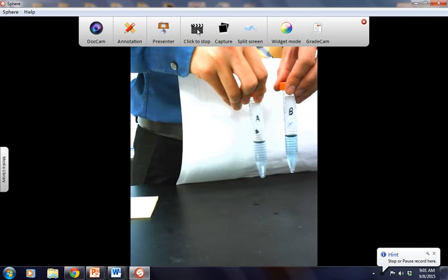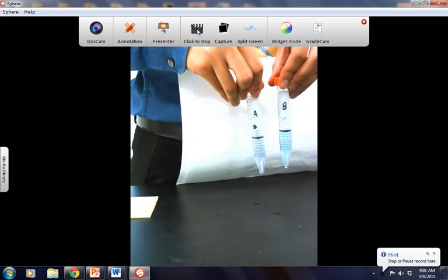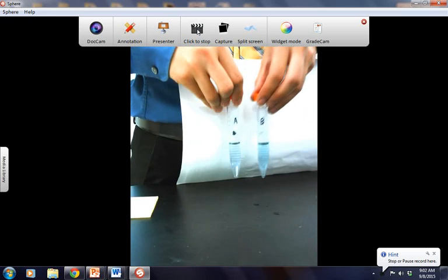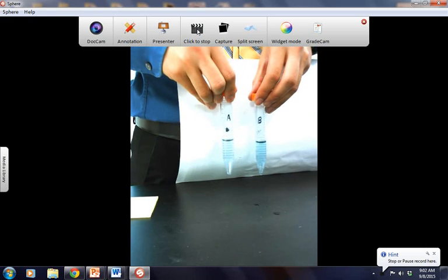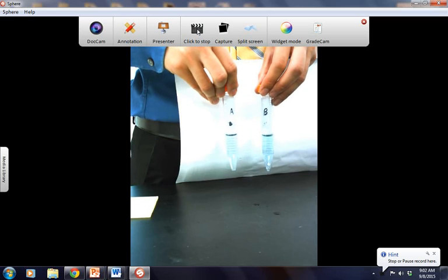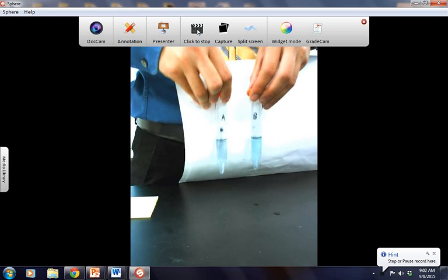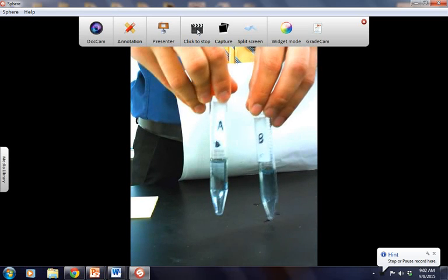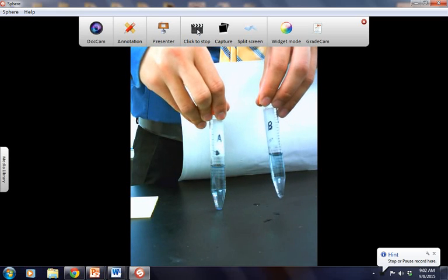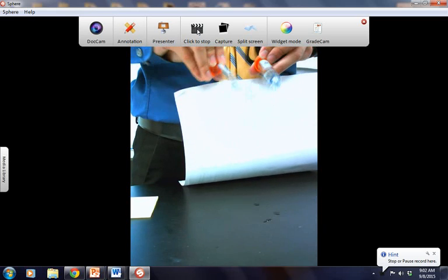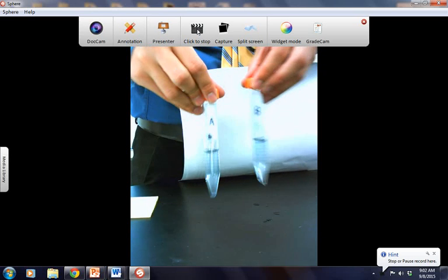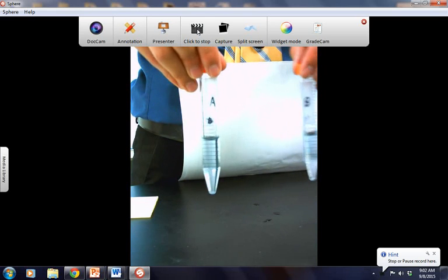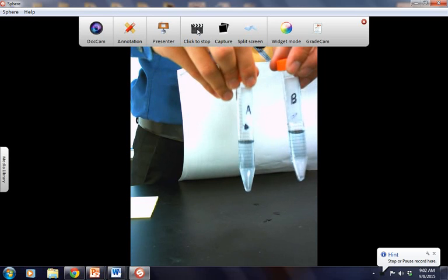For experiment three, we are going to use a stopwatch and find the exact time in seconds it takes for each liquid to return to its original condition. Both of them are still a little bit blue — we will wait a little bit as there is a color change back to a clear liquid. On the video it looks a little blue still because of my shirt, but here we go — here is experiment three.